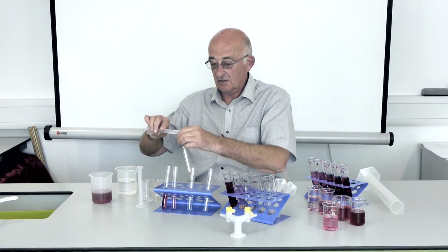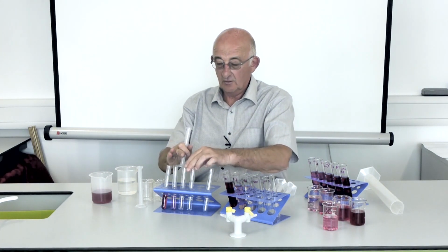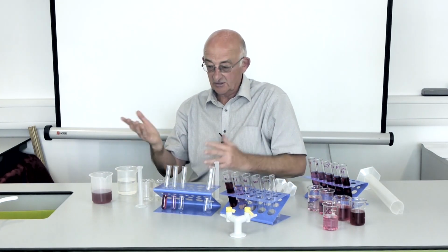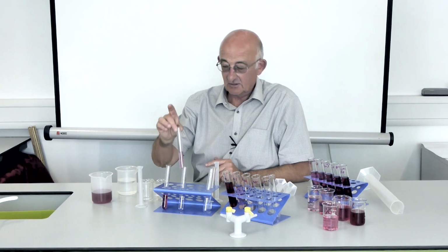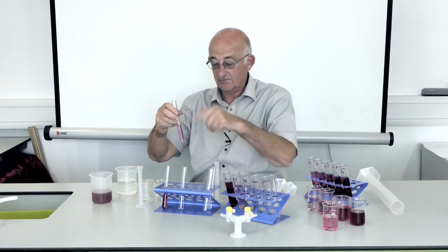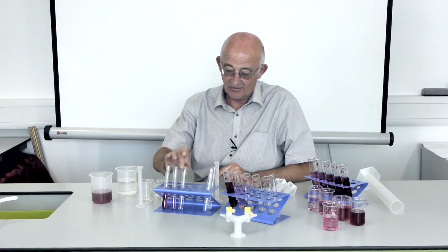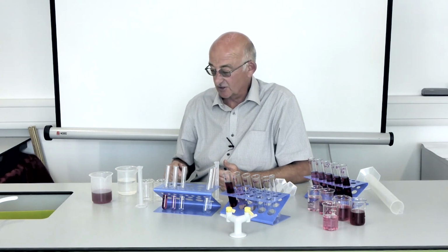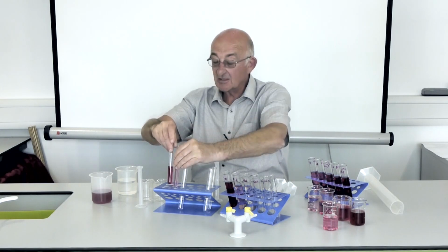Into the next tube, so that's 0.01. I'll move that away for the time being, and that's the methodology. We're taking 1 mil of the first solution into the second container, in this case a test tube, and 9 mil of water, give it a good old shake up so it's fully mixed up. Take 1 mil from the second test tube into the third, add 9 of water, and go down as far as the number of dilutions that you're particularly looking for. You can see that they're starting to become quite noticeably different.